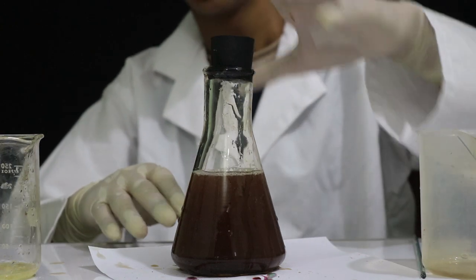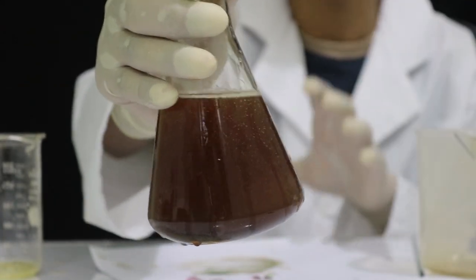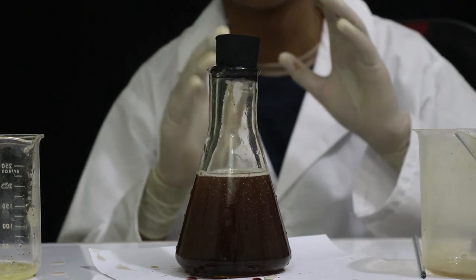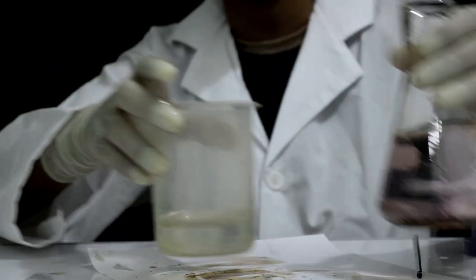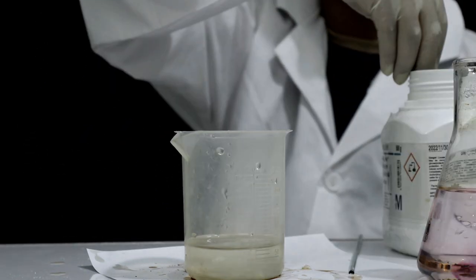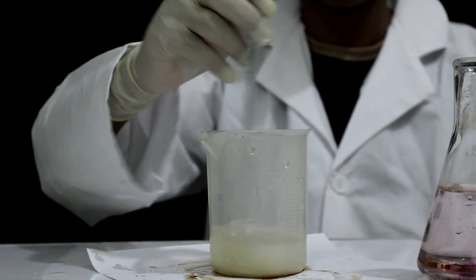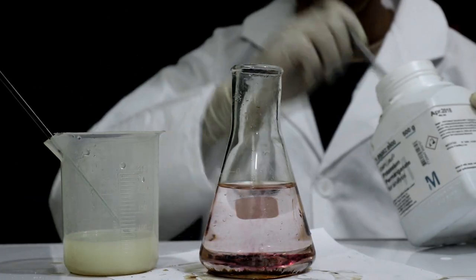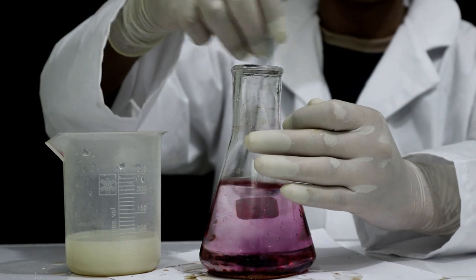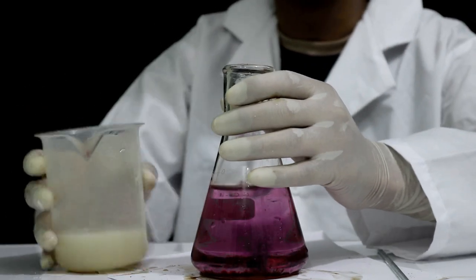We are going to do this experiment. I think we will do this experiment very well. I think we are going to get started. This is the perfect version of the camera. So we are going to get started.